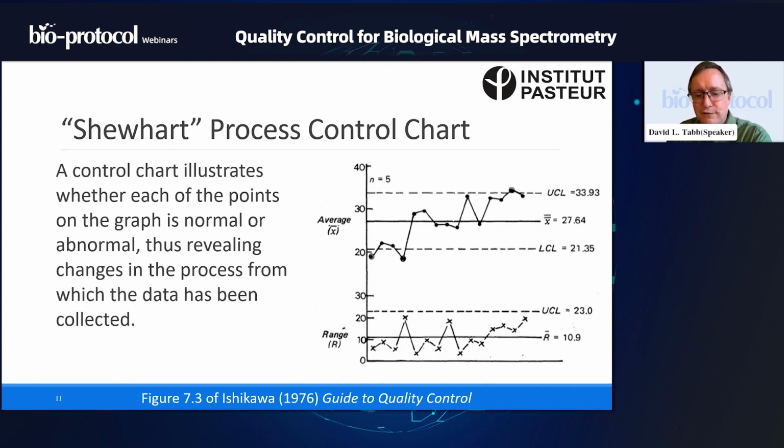So let us imagine, first of all, that we're trying to summarize a day, and maybe each day is going to be another point along the x-axis here. So maybe I've performed 5 QC experiments today on the instrument alongside all the experimental stuff we did. So I can say, just to use an example, what was the median number of distinct peptide sequences that I saw from our QC standard today?